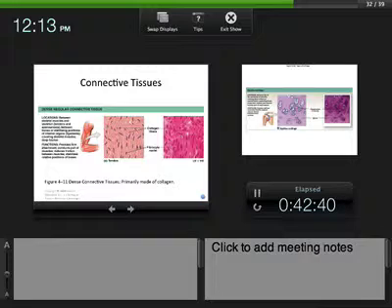Moving to the dense connective tissues, there's dense regular connective tissue. Looks like the only one I'm going to have you guys identify. Dense regular connective tissue is basically tendons. You can identify it by this tight regular pattern that they have.